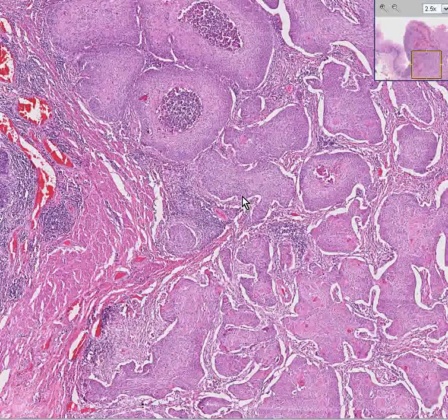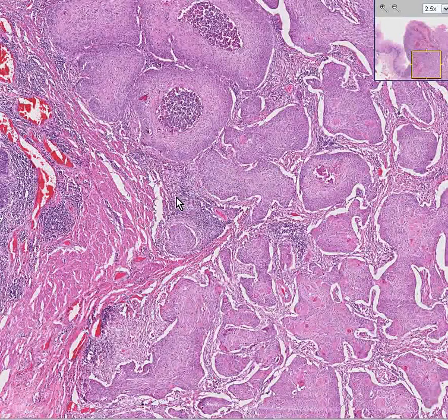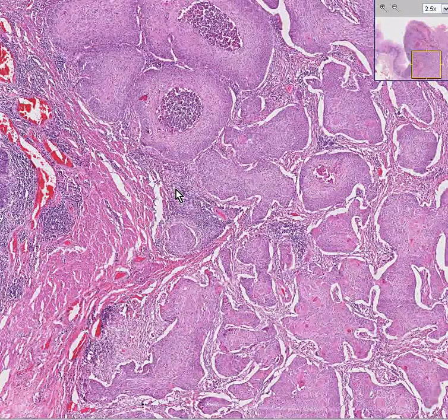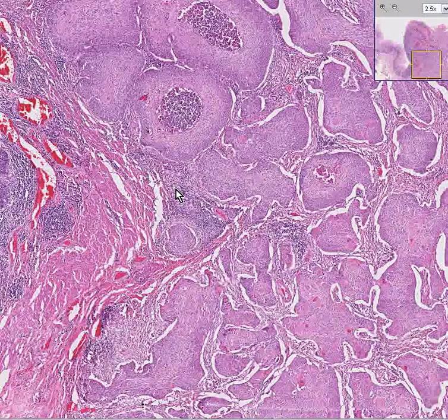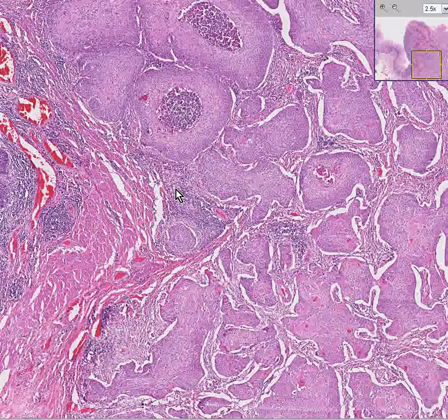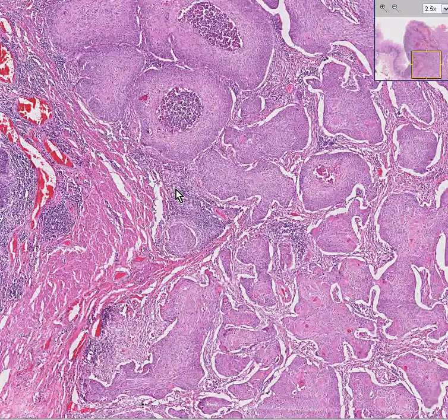This is squamous cell carcinoma of the esophagus. It's not the best one I've ever seen, and it's not the worst one I've ever seen, so how about if we call it moderately differentiated? Thank you very much.